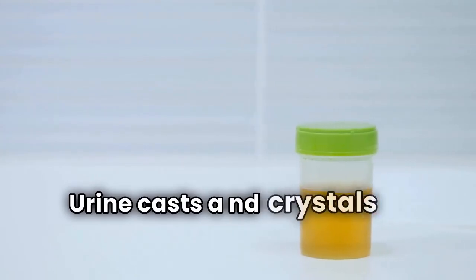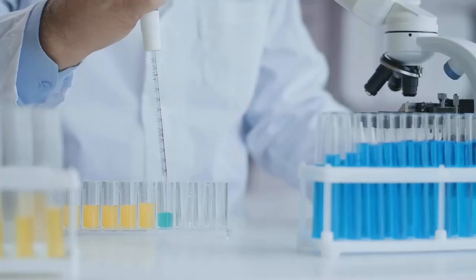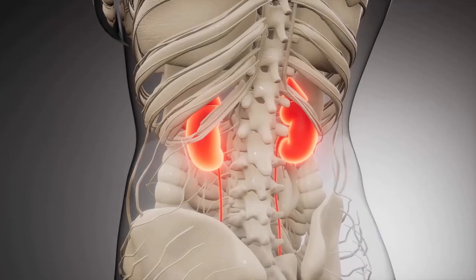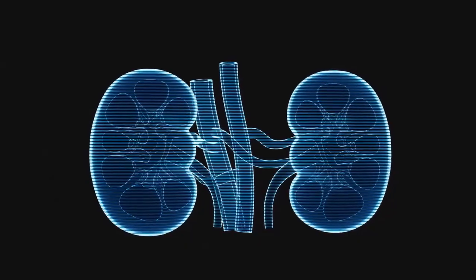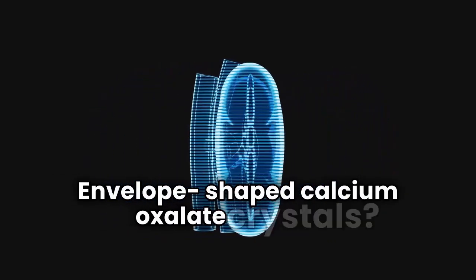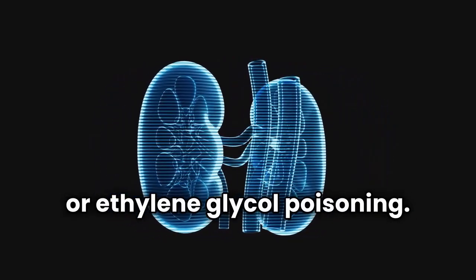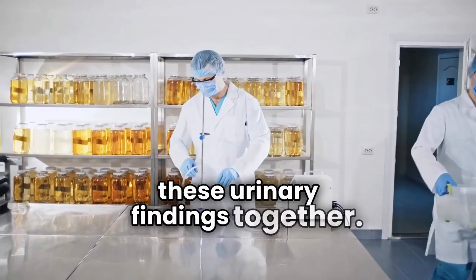Urine casts and crystals are like diagnostic fingerprints, small but significant. These tiny structures can reveal a lot about kidney health. A red blood cell cast? That could mean glomerulonephritis. Envelope-shaped calcium oxalate crystals? They hint at kidney stones or ethylene glycol poisoning. In this presentation, we'll decode these urinary findings together.